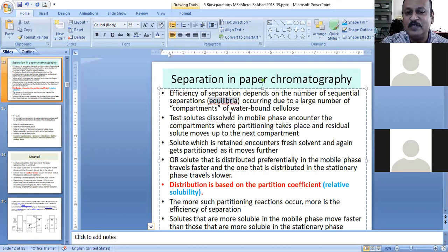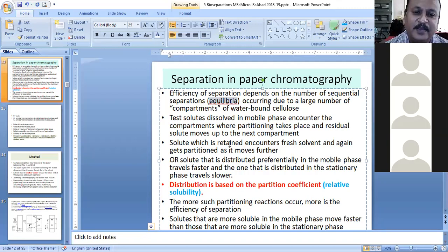So what is the meaning of this equilibrium based reaction? The forward reaction will be equal to the backward reaction. Wonderful answer. So this is a reaction where, for example, I have a small part of the liquid, the solvent, which is carrying the solute. And suppose I have, for example, 100 molecules of the solute.